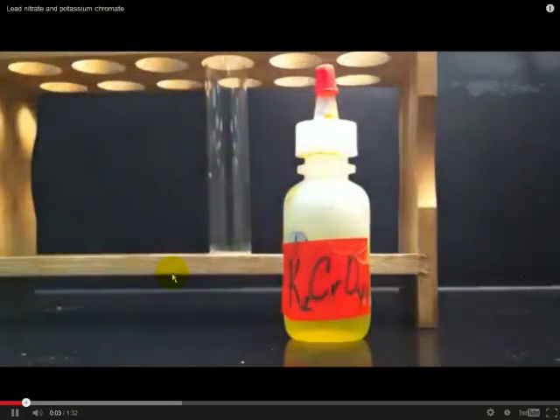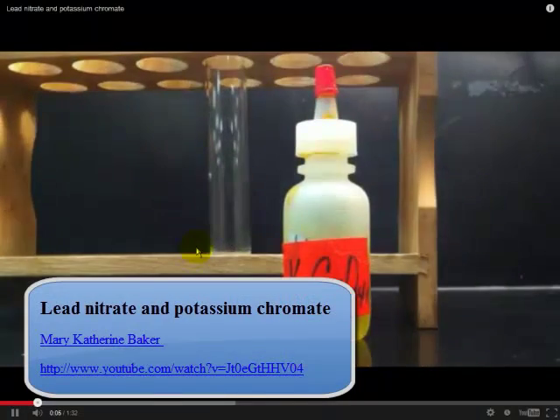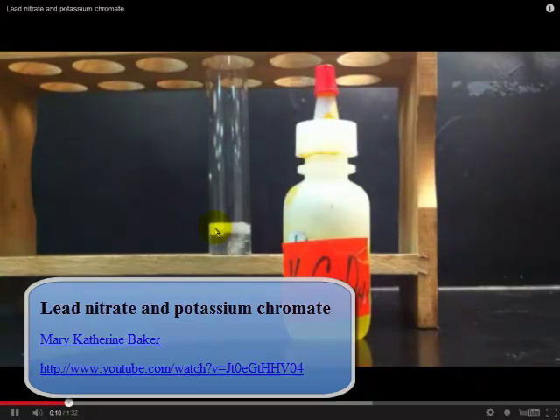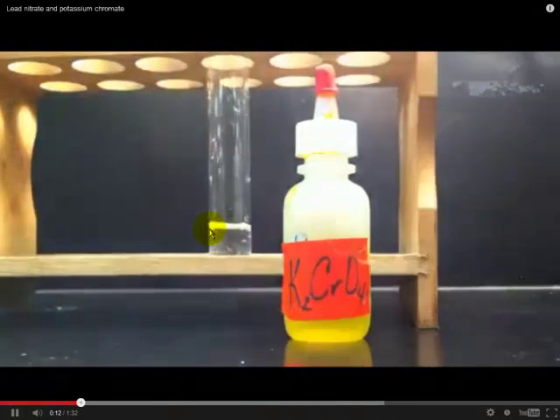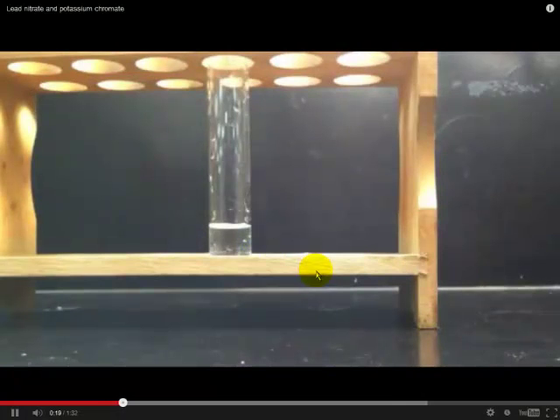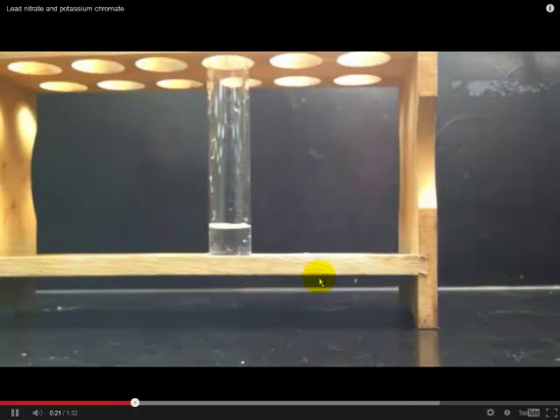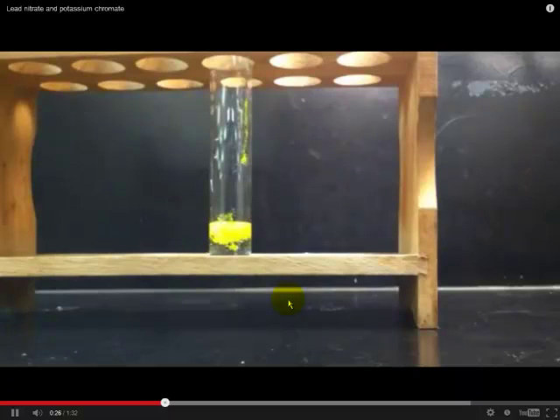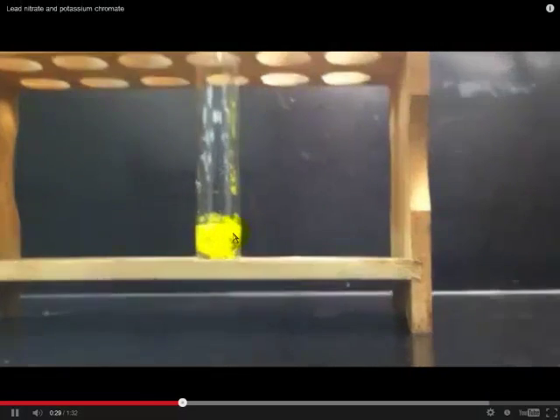Here's our setup. Here's our colorless lead nitrate solution being placed into a boiling tube. Here's our potassium chromate — a yellow clear solution. Adding those two together, you can straight away see the formation of a precipitate of lead chromate being formed by the combination of our two solutions.